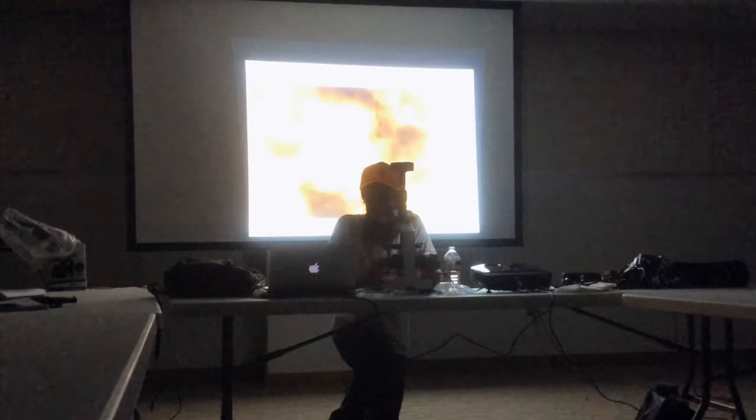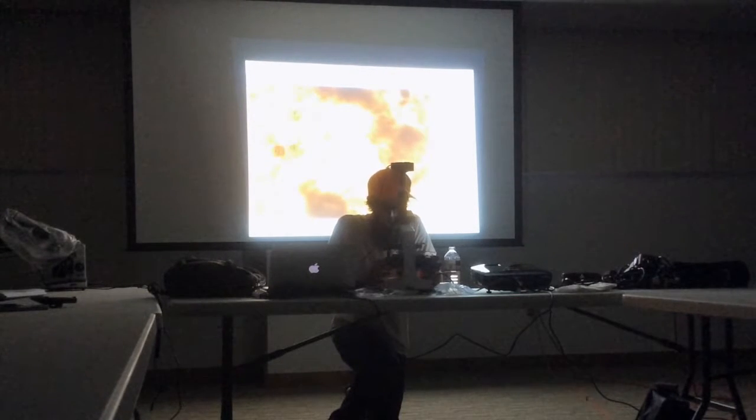So I'm tracing this fungus or whatever it is, and if that is a fungus, it's definitely not a good one because it's so skinny and thin, and it's also up like that, so I'm tracing through to see it. Sometimes you have to change how you're focusing to see what's in every slide.